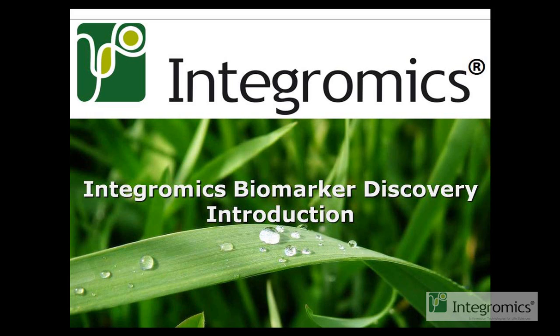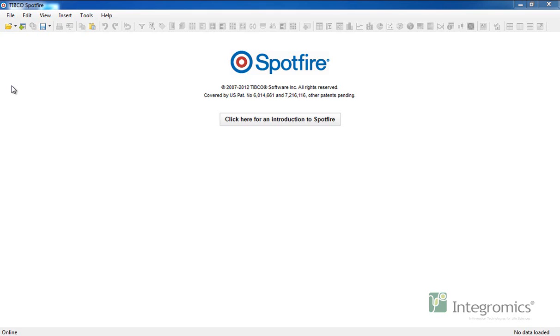In this tutorial, we will talk about Integromics Biomarker Discovery, or IBD, an application for microarray analysis that runs on the TIBCO Spotfire platform. In order to analyze a microarray experiment using IBD, we need to load it using the Integromics Biomarker Discovery option in the Open From menu.